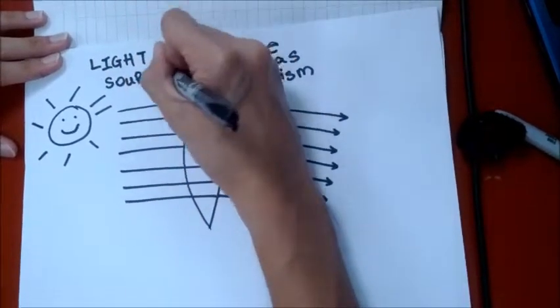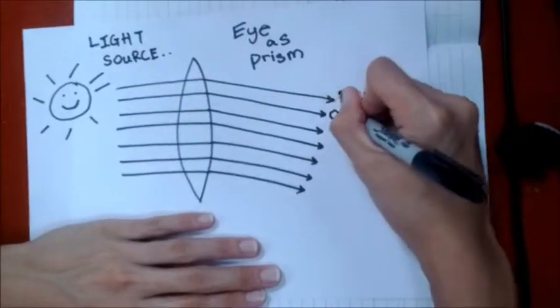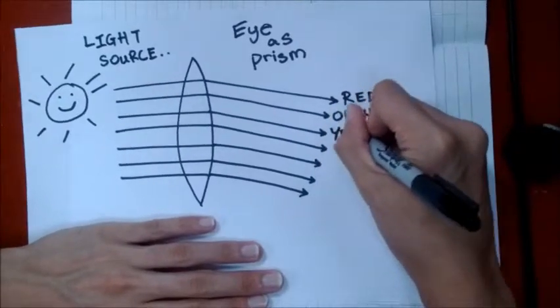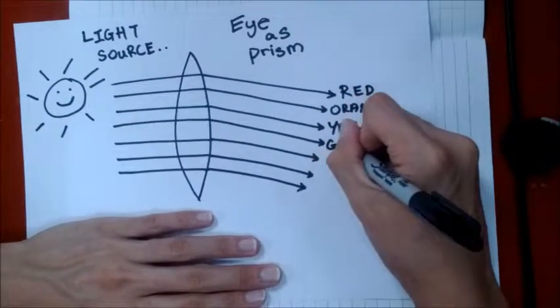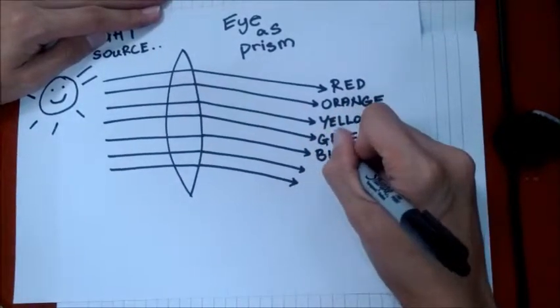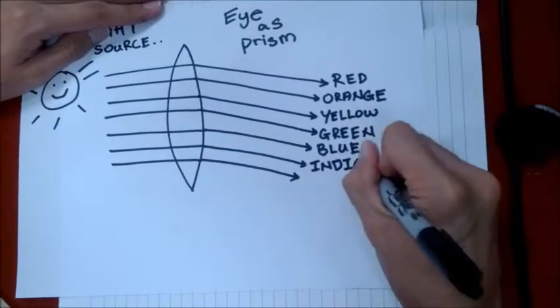Electromagnetic radiation, such as visible light, is commonly treated as a wave phenomenon, characterized by a wavelength or frequency. Visible wavelengths cover a range from approximately 400 to 800 nanometers. The longest visible wavelength is red and the shortest is violet.